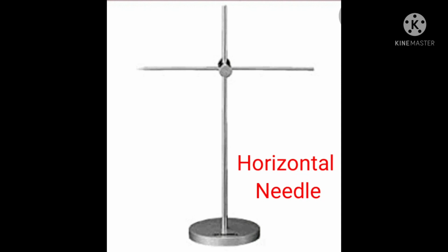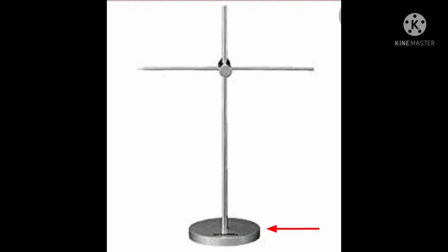Horizontal needle. It is a very convenient accessory instrument for the craniometric measurement. It consists of a small steel vertical metal rod on a heavy base. The upright rod has a socket which may be raised and lowered. A cross needle may be pushed in and out and can be fixed at a desired point. When a skull is clamped into a craniophore, this needle is helpful in orienting the skull in the Frankfurt horizontal plane.